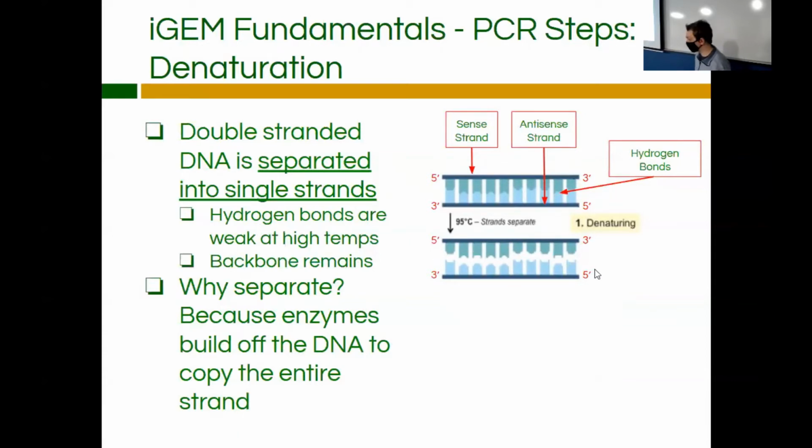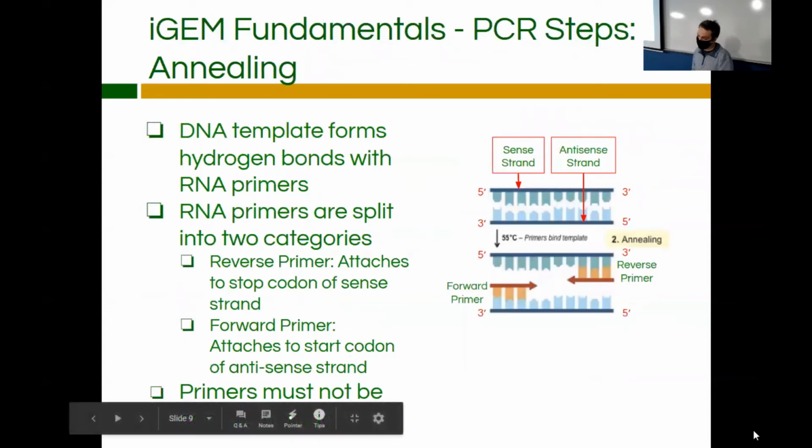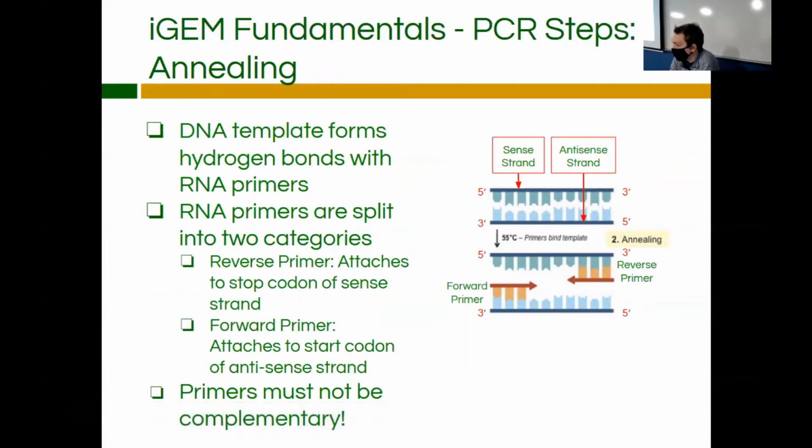So why do we want to separate it, though? That's because in order to make a copy, we're going to need to use these as template strands in order to replicate them. So each of these can turn into another duplicate strand, which begins in the next step, which is called annealing. And this is where something called primers start coming into practice.